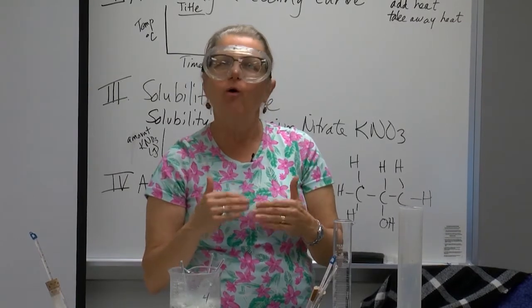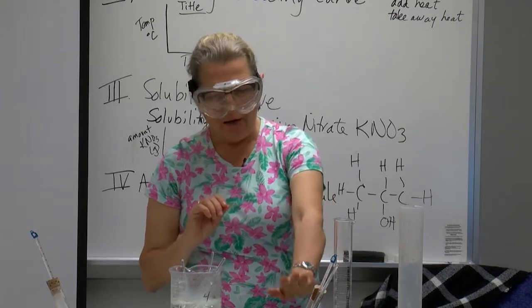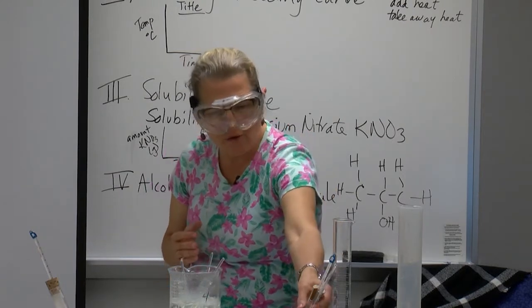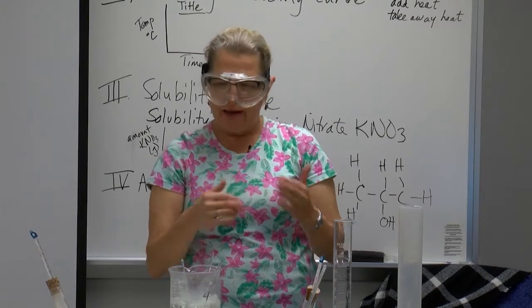And in lecture, we'll go over that a little bit. Hopefully, it'll be made a little bit more clear. For now, we're going to leave this alone. Like I said, I'm going to provide the data. When it starts to form a solid, we'll come back to it. We'll note the temperature, and we'll continue.